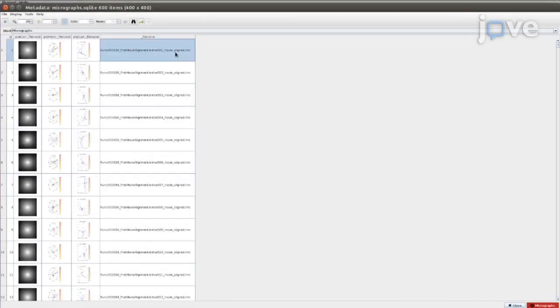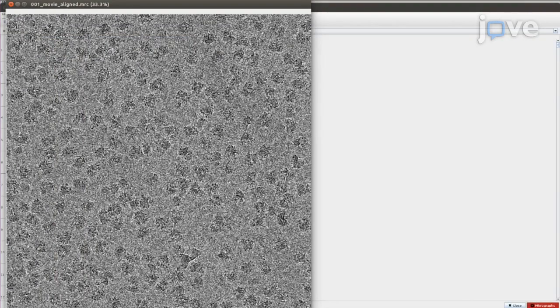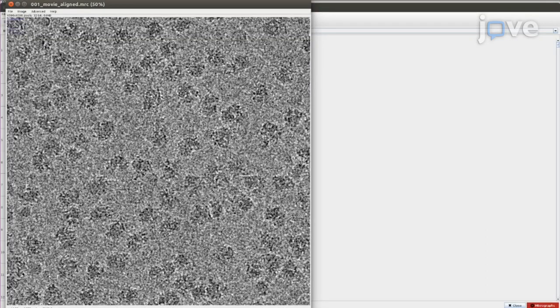Scipion provides the tools to create the whole processing workflow in an integrative way for single particle analysis and cryo-EM to achieve a high-resolution reconstruction of the biological specimen. This framework makes it possible to create the processing workflow using several image processing packages, favoring interoperability, traceability, reproducibility, and the combination of information conveyed by different methods to generate a more accurate output.